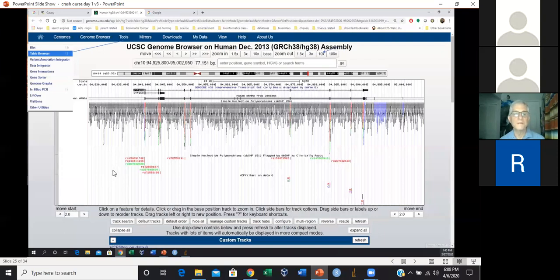And below it here are what are called the flagged variants. The ones in red are the ones that are of most interest because these are ones where it's going to either change the sequence of the RNA itself or how it's spliced to form the RNA, which is even worse because it makes for marked distortions in the end sequence that's generated.